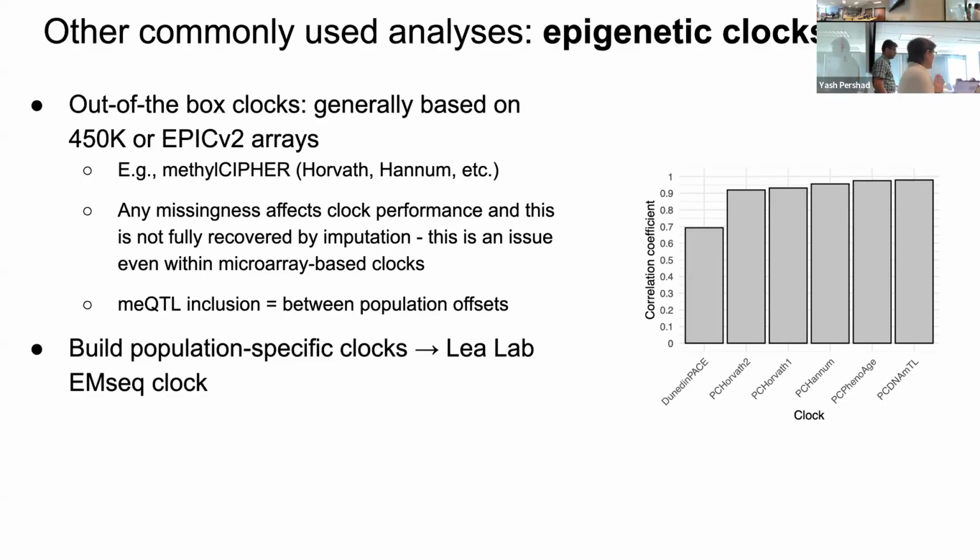Okay, so if you want to employ epigenetic clocks from your methylation data, you would have your percent methylation matrix that we got in the beginning, impute those missing values, and then you can use out-of-the-box clocks. So these are really, really easy to implement. And if you have any questions, get in touch with us. This is bread and butter for sure.